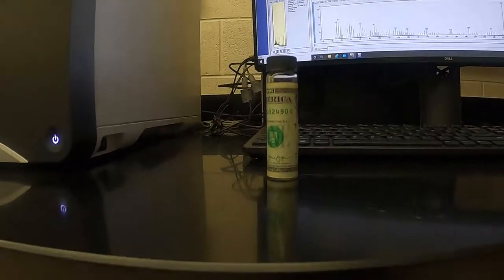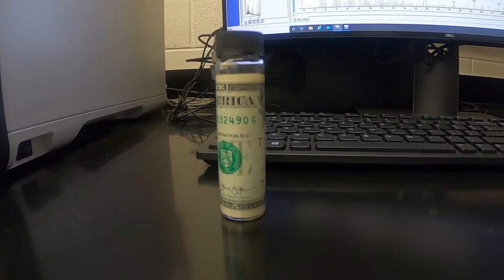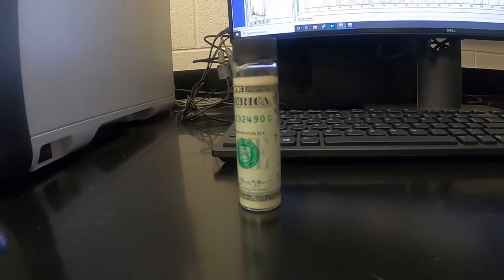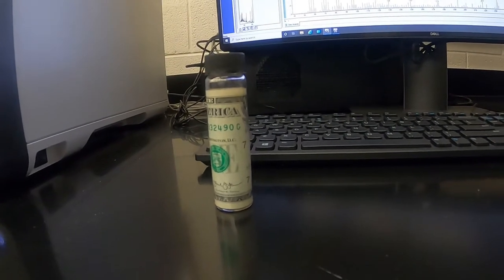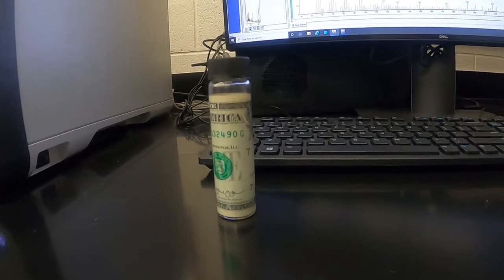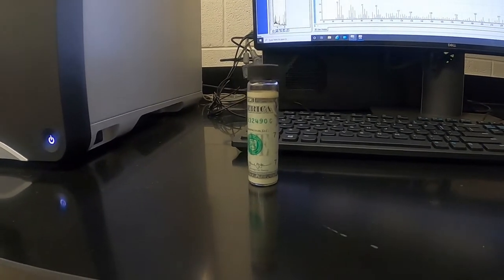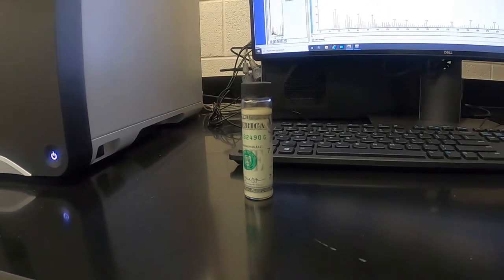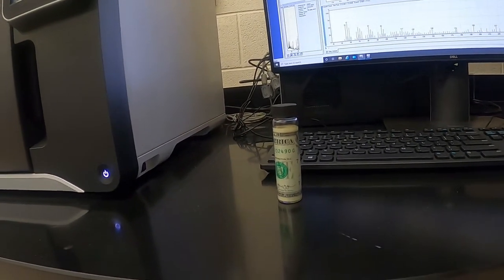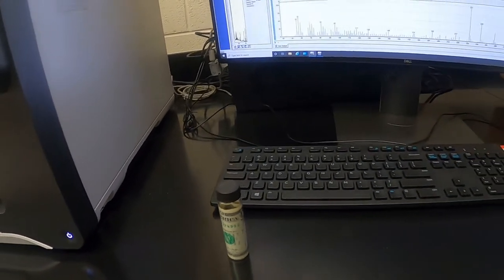Other applications of this for environmental analysis have included air sampling, water analysis, and soil analysis. And ultimately, GC-MS can really be used for many types of applications related to chemical analysis. It's actually one of the more powerful tools in the lab. We have attached to it several different library databases comprised of about 1 million compounds. So anything that you want to analyze or characterize, this instrument can pretty much determine what it is.